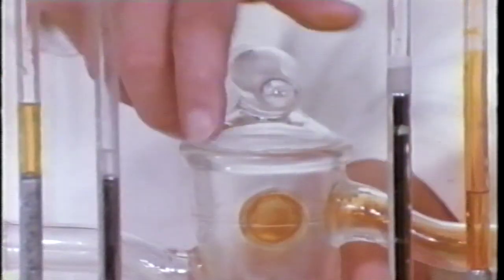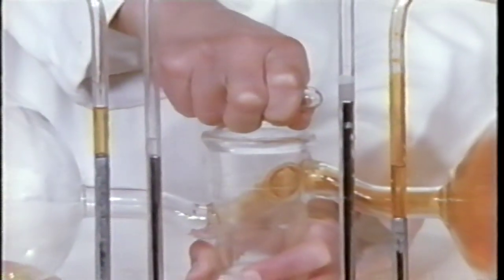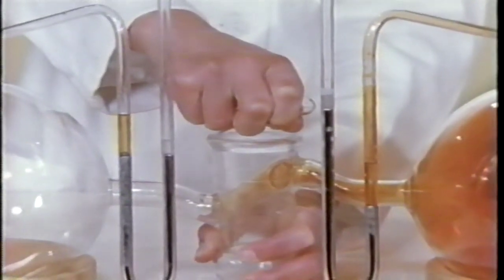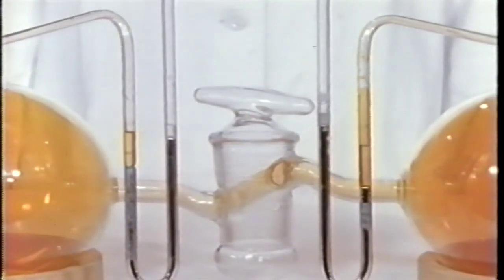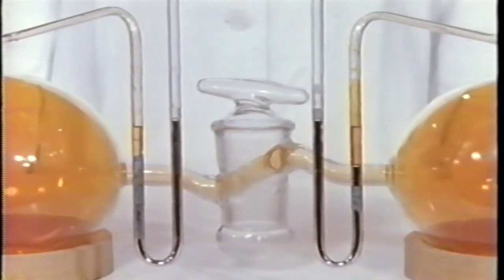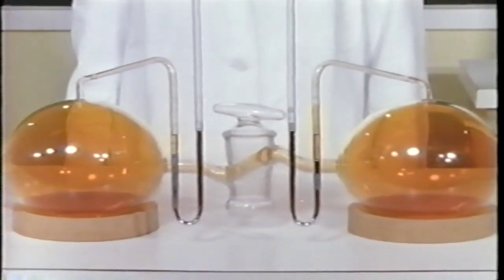Now let's open this stopcock so the bromine has access to the other bulb. There it goes. As the color appears in the left bulb, the pressure rises on the left manometer, while the other manometer shows that the pressure is dropping on the right. Everything settles down quickly. The colors are no longer changing, and the pressures in the two bulbs are now equal. We have reached pressure equilibrium.